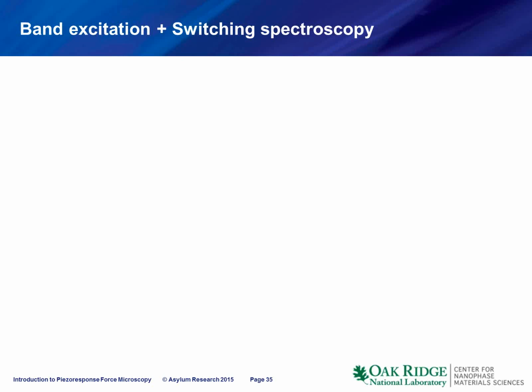What we can do is combine this piezoresponse spectroscopy and the band excitation method. We substitute the sinusoidal wave by the band excitation waveform, and we get this four-dimensional signal which can be deconvoluted to give us the piezoresponse loop, the resonant frequency loop, and the dissipation.